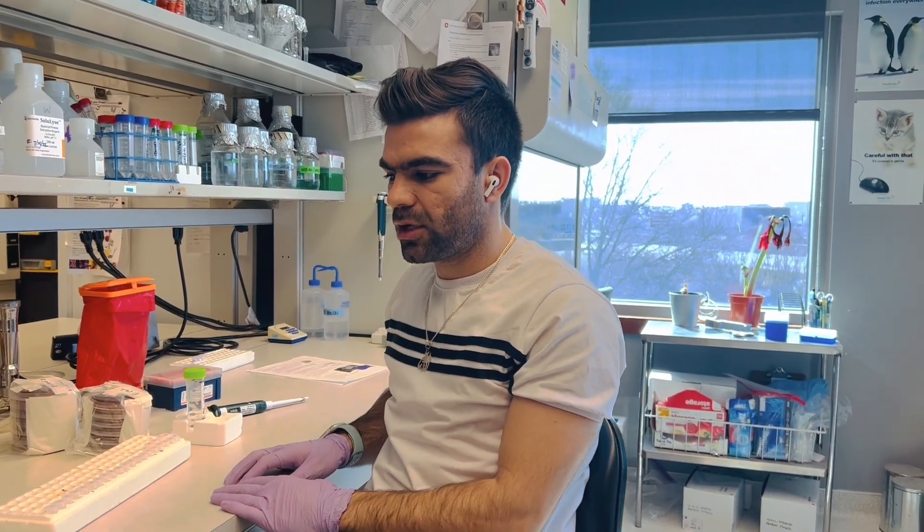Hello friends. Today I want to speak and show how a conventional PCR works.